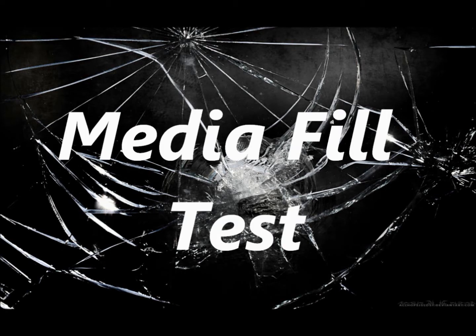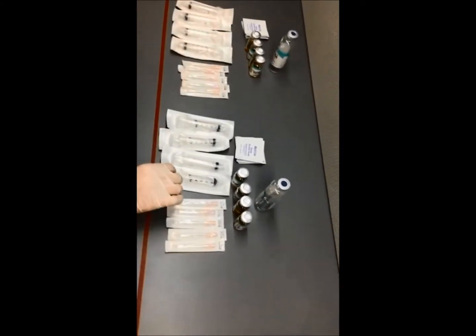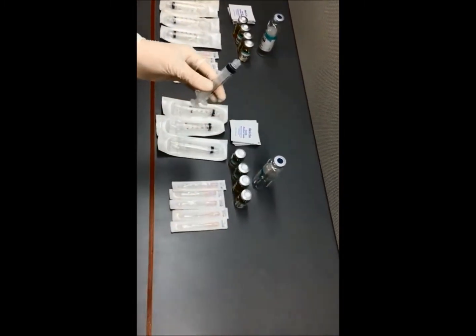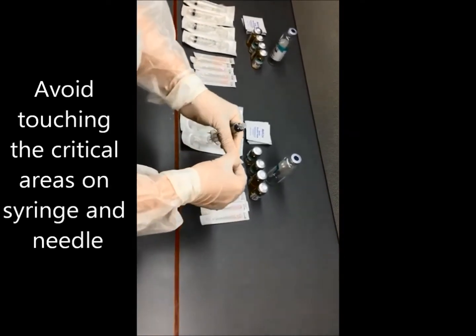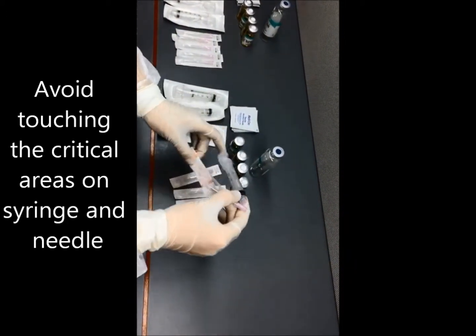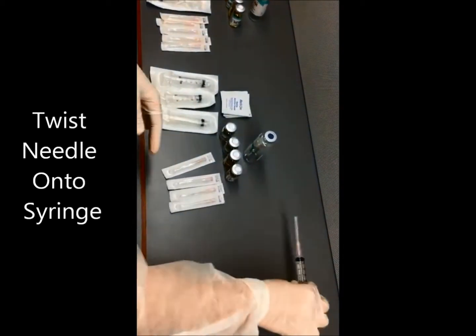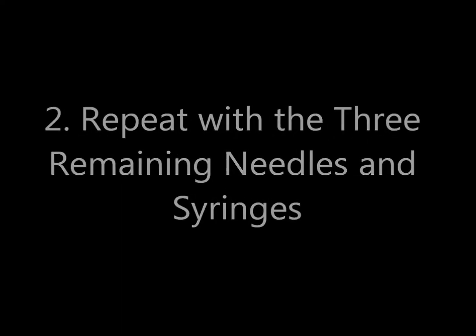Media fill test. Number one: attach a needle to a syringe and place it to the side. Avoid touching the critical areas on the syringe and needle. Twist the needle onto the syringe. Number two: repeat with the three remaining needles and syringes.